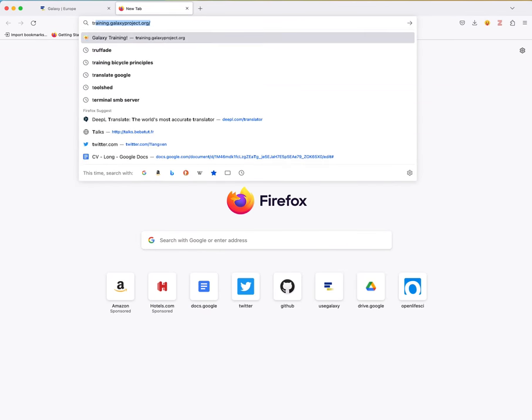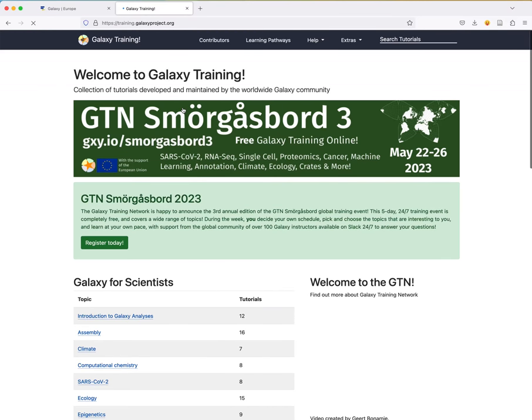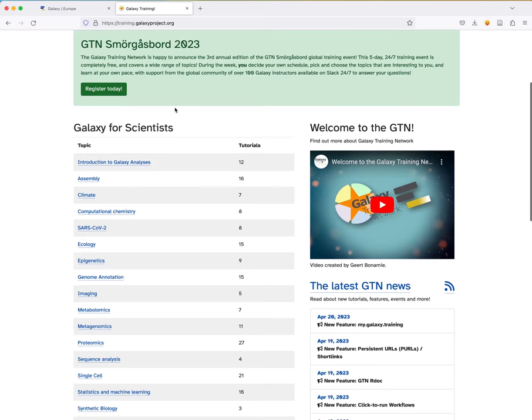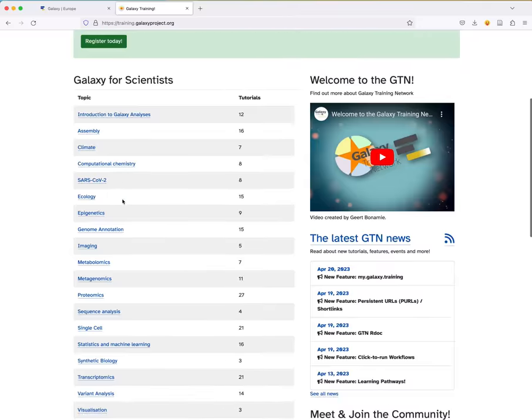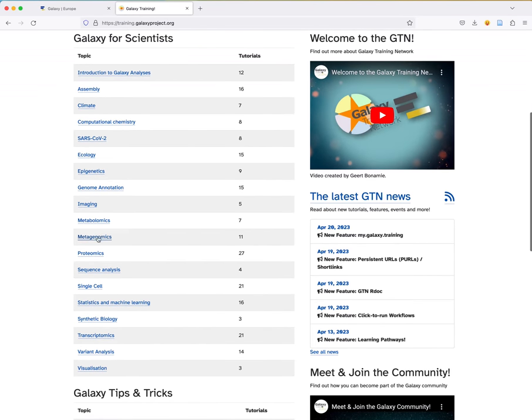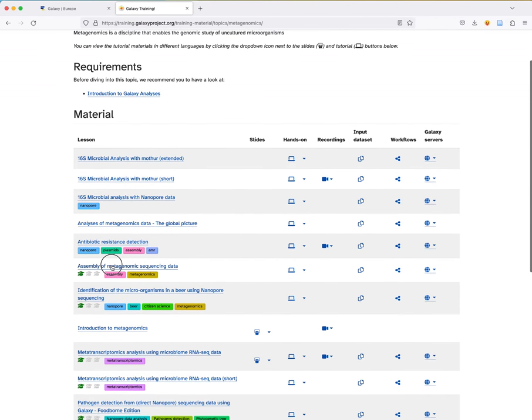Hello everybody, I'm Bernice Batu and today I will teach you about the assembly of metagenomics sequencing data using Galaxy. Follow one of the tutorials available in the Galaxy Training Network that you can access by typing training.galaxyproject.org in your web browser. You will be redirected to a page where you can find all the tutorials, and if you scroll down to the topic sections and go to metagenomics, you will see several tutorials, including the assembly of metagenomic sequencing data.